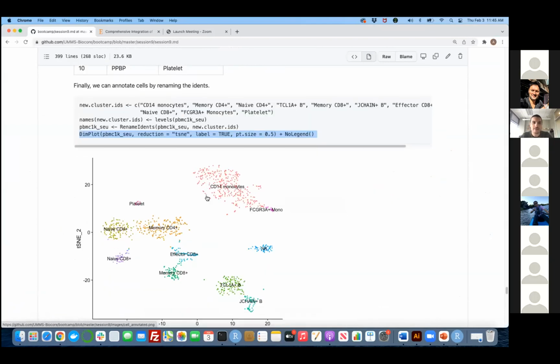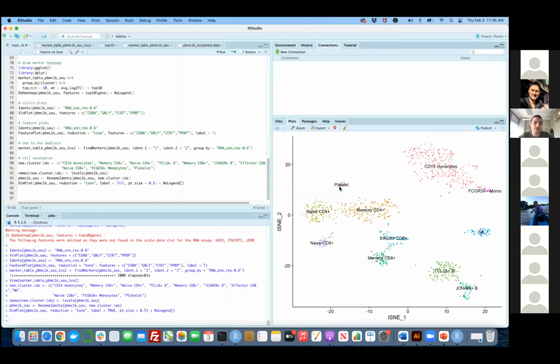So basically, guys, this is the most essential kind of analysis that you can do with single cell. What we have done was that we picked up genes, we filtered out some cells that we believe could be hindering the analysis. Then we started clustering. And after clustering, we tested the significant changes of those genes within each cluster as opposed to the other ones to make decisions about the identities of each cell type.